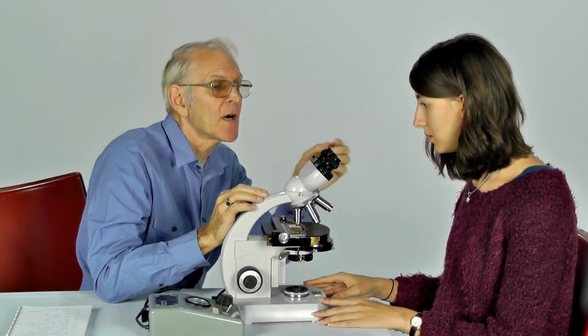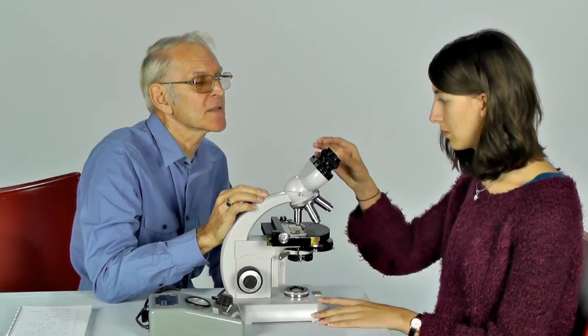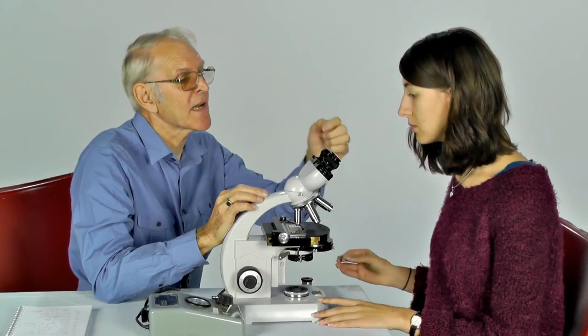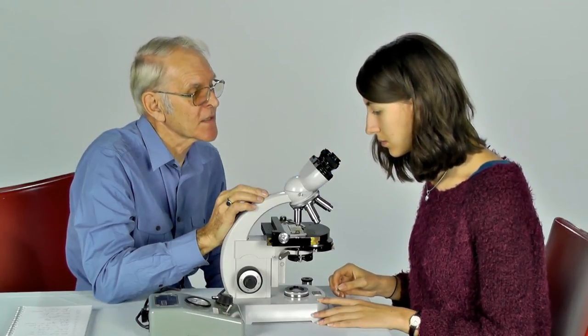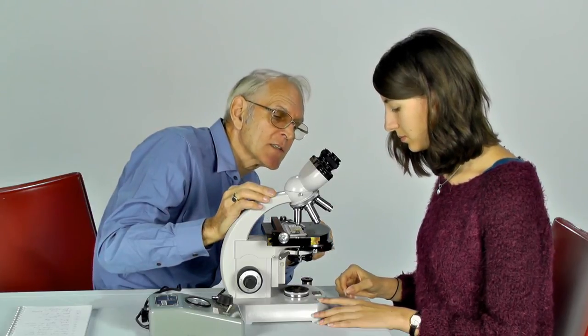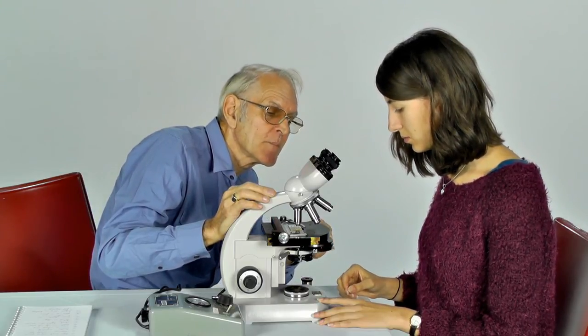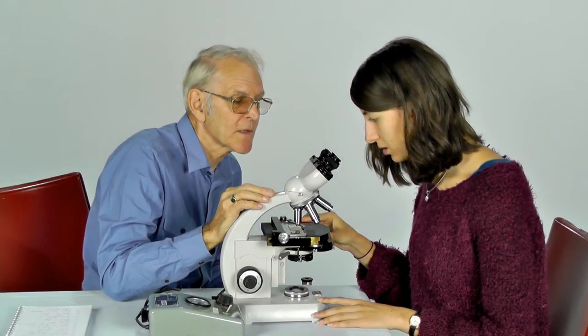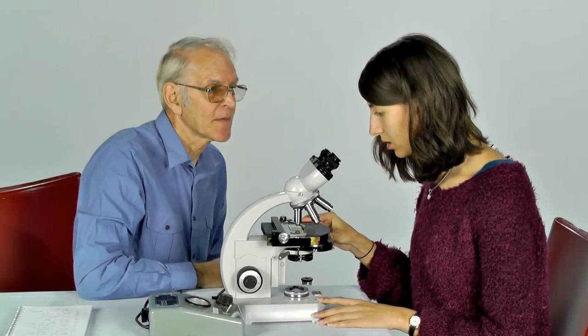So, it's a matter of taking out one of the eyepieces and if you look down, you should be able to see a circular patch of light. Yep. Now, we adjust the diaphragm below the condenser. This is called the aperture diaphragm.